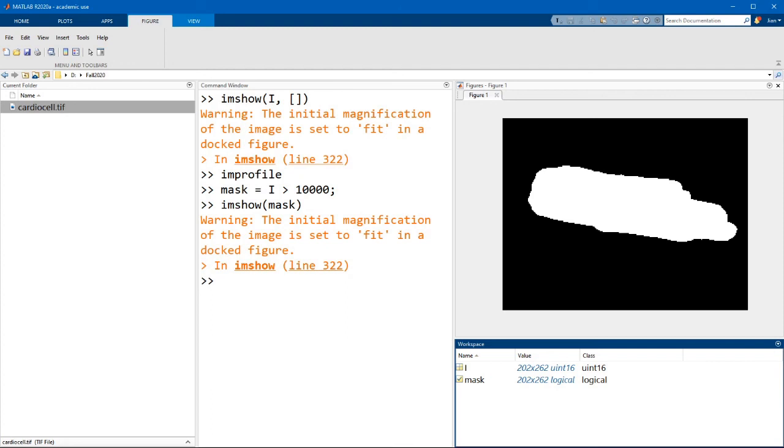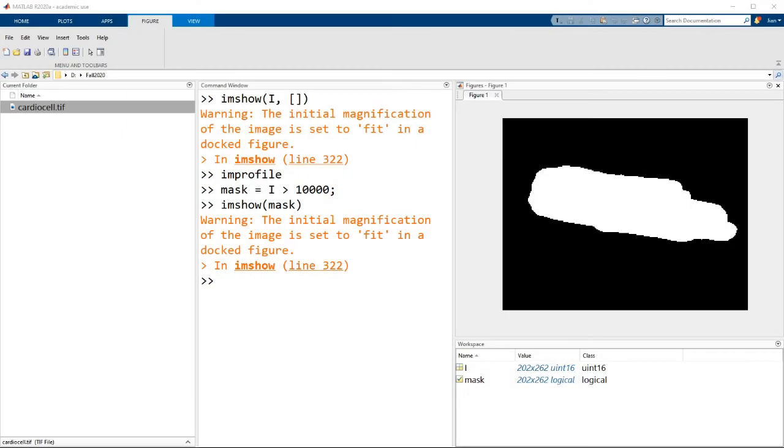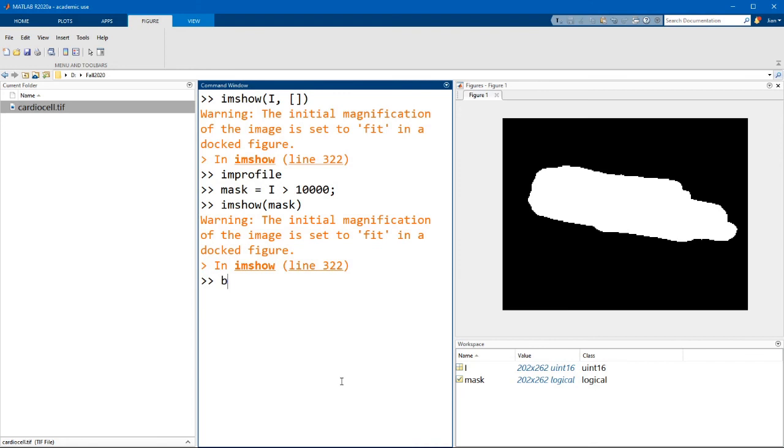Now that we have our mask, let's have a look at how we would visualize this along with our original image. The first function that we're going to use is bwperim. This creates a logical matrix containing the perimeter of the true regions of the input mask. Let me show you what I mean. Let's go back to MATLAB and run bw equals bwperim mask.